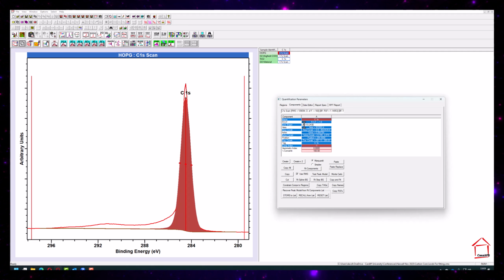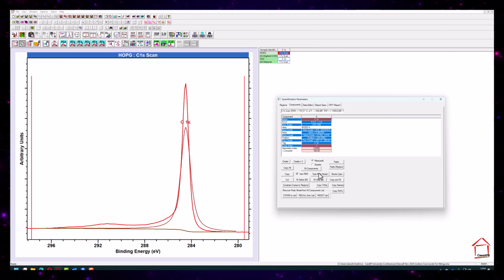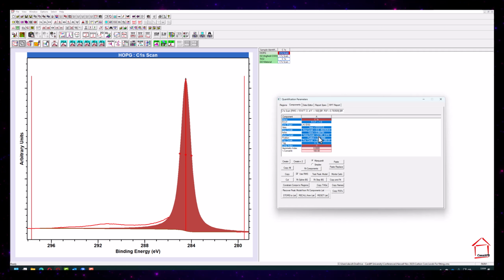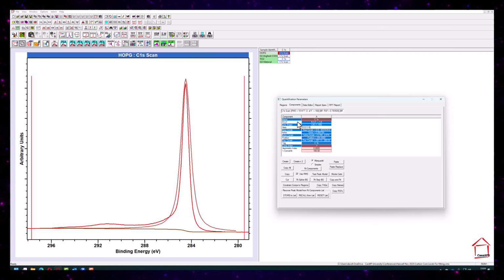So for example, if I was to change this number to 1,100, we can see we have this much more Voigt or Lorentzian type function where the tails come out. If I explicitly put in that other number 1 and hit return, again the data hasn't really changed.